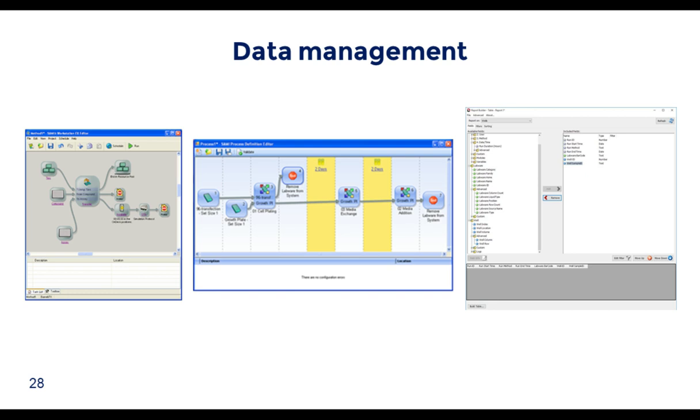Another change in daily activities is in methods of data management. Tracking of clones in a manual workflow might involve spreadsheets of clone IDs and locations on plates with descriptions of which clones were scaled up on what day. This process can be automated, with the database tracking the path of each clone through the workflow. Data from external analysis can be uploaded and appended to each clone's history.